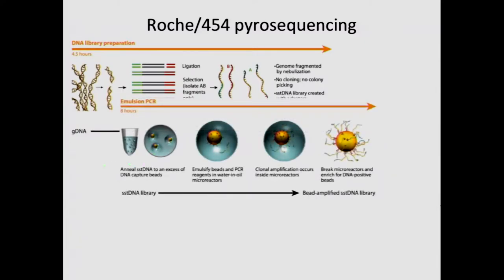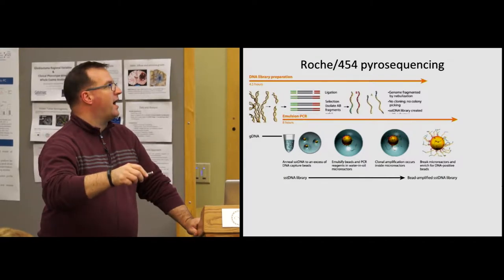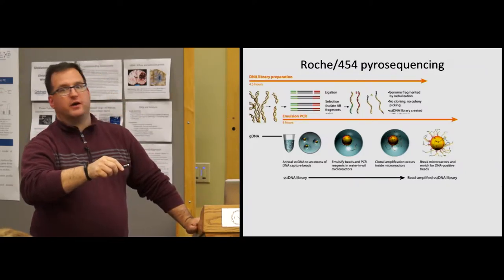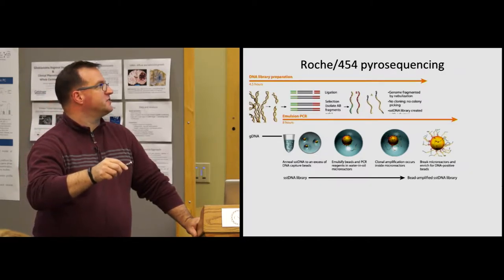The next step then is this PCR reaction, this oil emulsion droplet PCR reaction, where in an aqueous oil mixture, which is vortexed rapidly, also containing these beads, you get these small aqueous droplets that are just a little bit bigger than the size of these beads. Okay, so there's an excess of DNA capture beads such that within any one droplet, there is most of the time no DNA. Most droplets that have a bead have no DNA in them. And then once in a small while, because there's a gross excess of beads and a gross excess of droplets relative to DNA, you have one and only one molecule of the single-stranded DNA there.